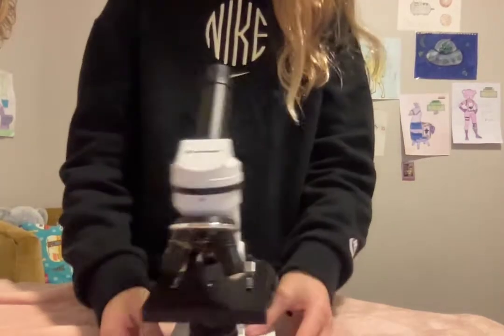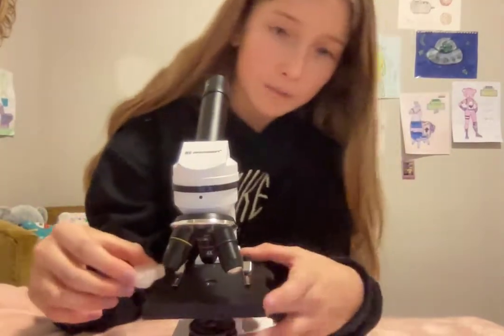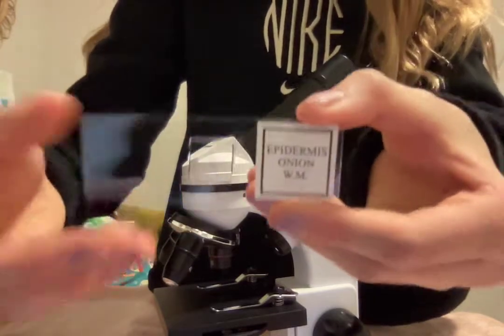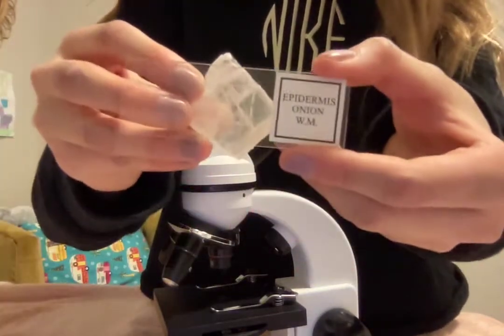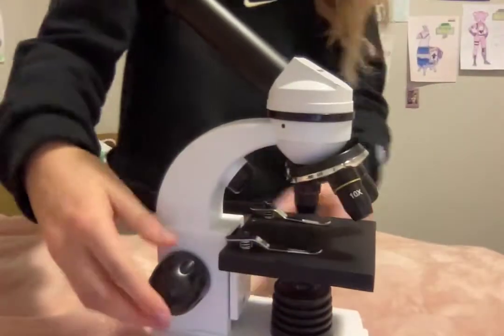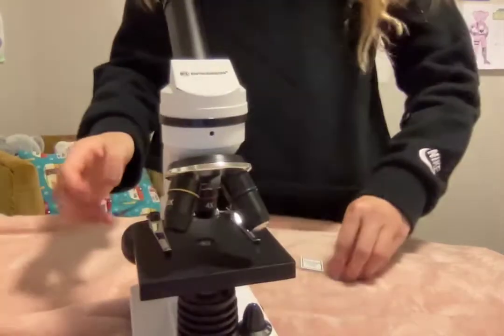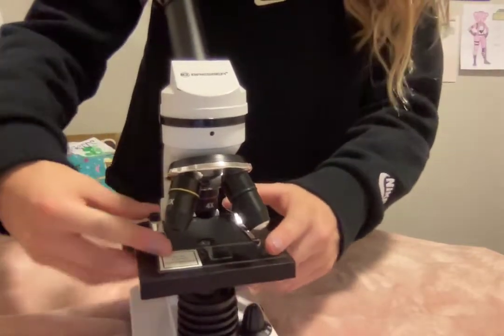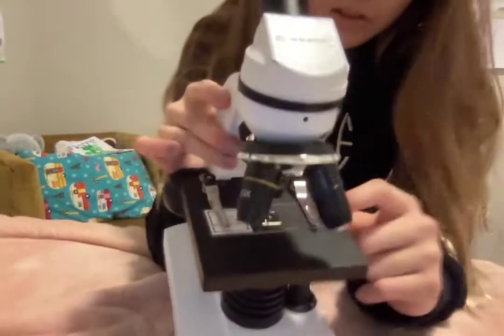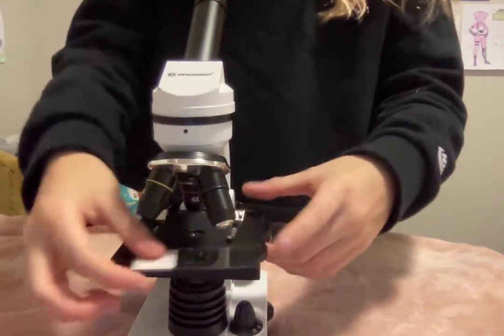Then what you want to do is choose something to look at. First I'm going to start with this crystal. If you do want to use a slide — for example, the epidermis onion — it's kind of hard to see, but there you can see that purple-ish color. You have these little tabs to lift it up, and then you have this hole right here. You're going to want to slide this right under and try to get the onion piece in the very middle. Be very careful — these are glass slides.